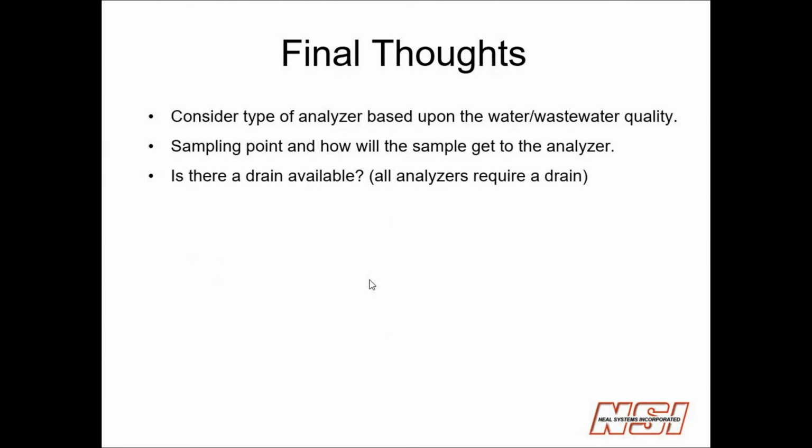That electrolyte solution that's in the probe analyzer is considered a reagent, and it does leach out through the membrane very slightly, and that would not be allowed to go back into your well. So you'd have to use a different type of method to drain. In this particular application, they actually went through the floor of the well station, and they made a little drain field outside to drain that sample.